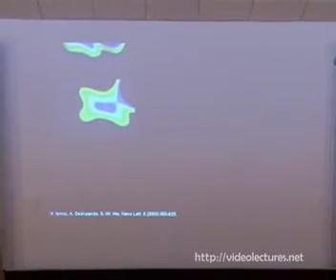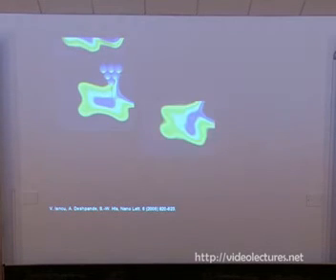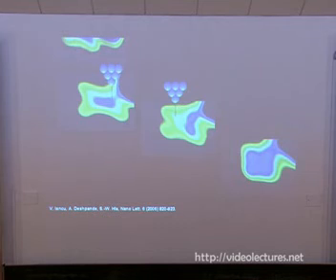Now the next step is whether we can change from one to another. So we start with a two-lobe one here, a molecule next to a copper cluster. We inject the tunneling electrons, and something happens. We inject again, and it switches to the four lobes. So we can actually switch one molecule at a time from bent to flat by injecting tunneling electrons. So we can manipulate single molecules, and we can switch them.